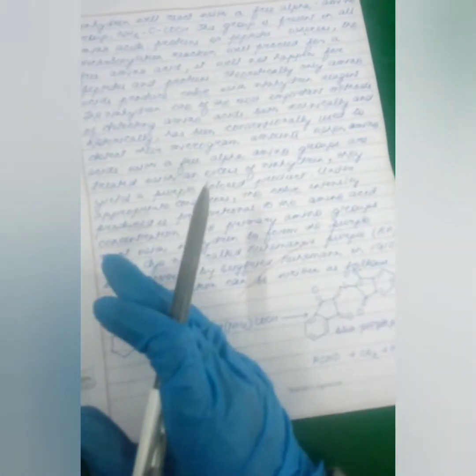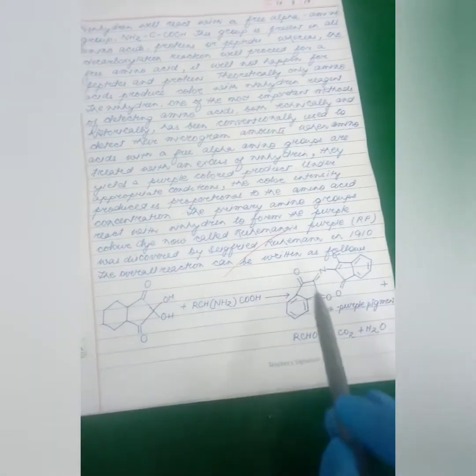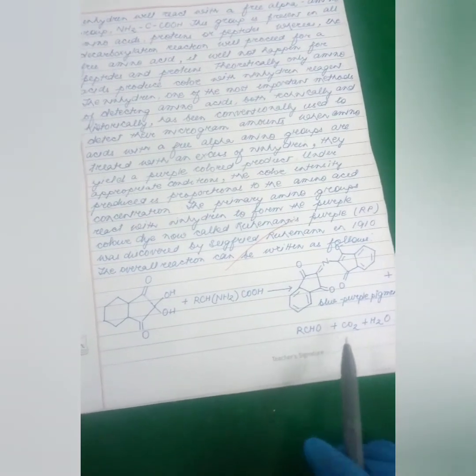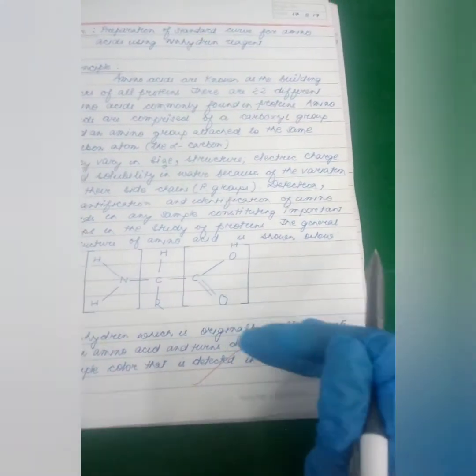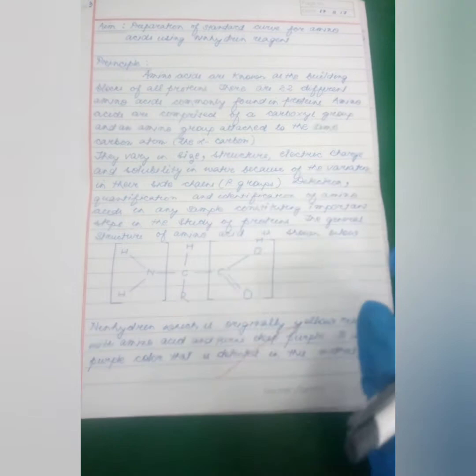When we studied the chemical properties of amino acids, they react with Ninhydrin to form a blue colored compound known as Ruhemann's purple. Through this purple color, we can detect the presence of amino acids in a given sample.